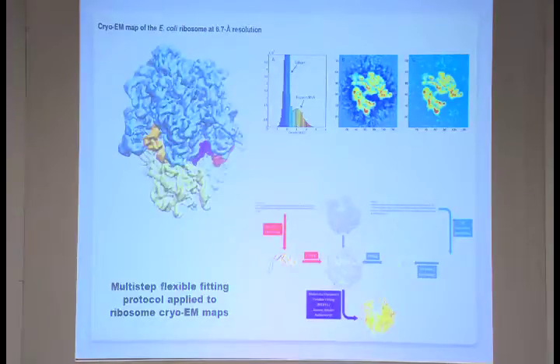So this is how you do it generally. For any this kind of fitting, you have to align the rigid body fitting in the map, and the coordinates of the atomic structure and the map should be roughly the same. If you take an atomic structure and a map that are not aligned, none of these methods work.